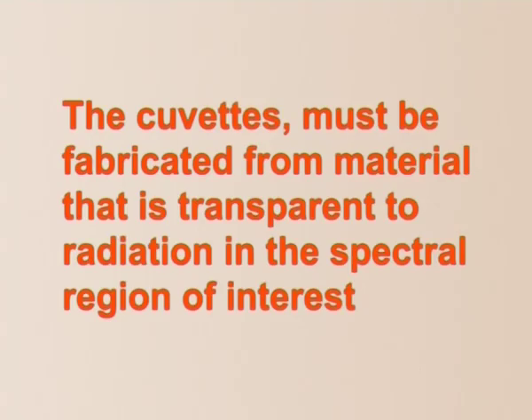Cuvettes, also called cells, are provided in pairs that have been carefully matched to make possible the transmission through the solvent and the sample. The cuvettes must be fabricated from material that is transparent to radiation in the spectral region of interest.